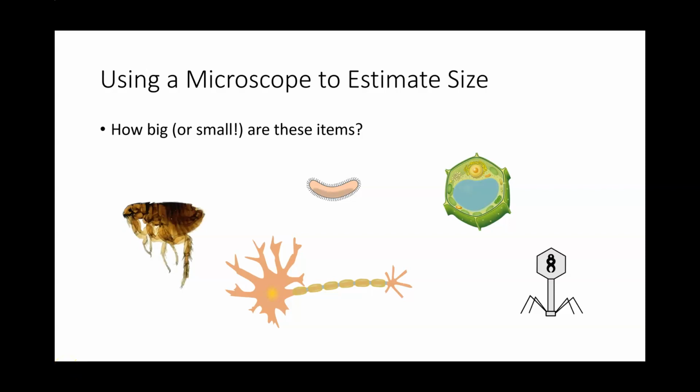Welcome Bio 107 students. In this video, we're going to learn how we can use a microscope to estimate the size of common biological specimens. To illustrate this concept, here are some examples of commonly studied biological specimens.